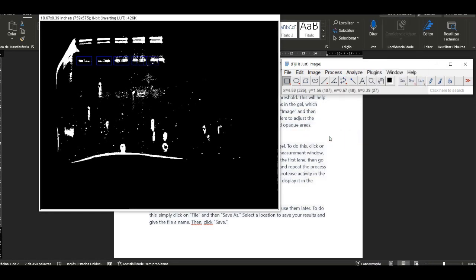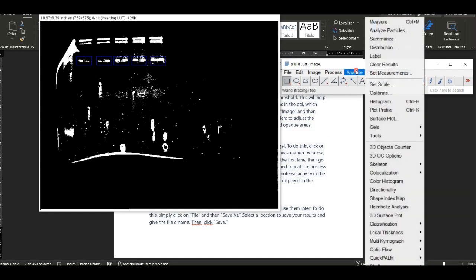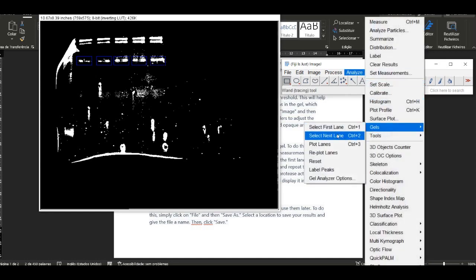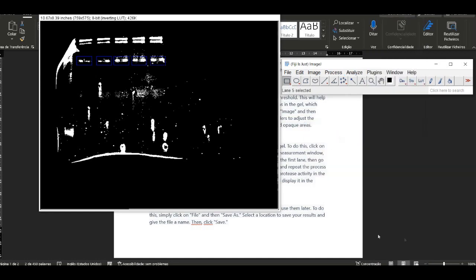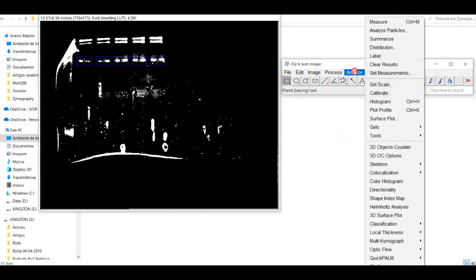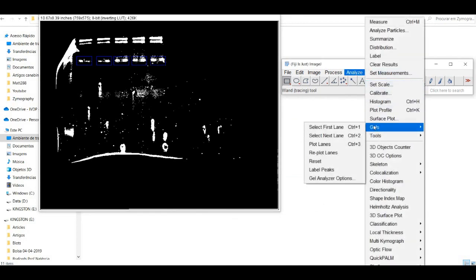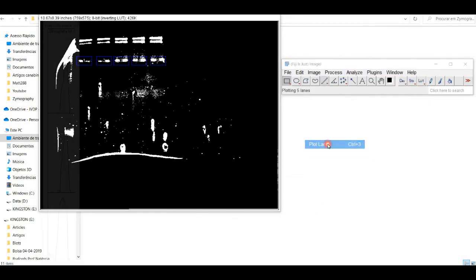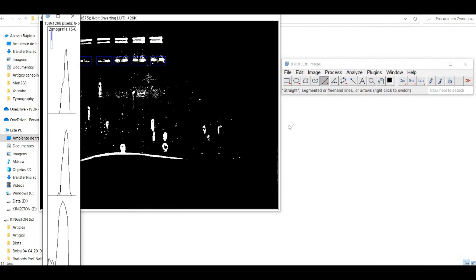After you complete the lane definition, go to Measure Gel Plot Lanes. If your peaks are well-defined, you just need to use the Magic Wand tool and click inside each peak, and ImageJ will calculate the total area of the selected areas and display it in the measurement window.